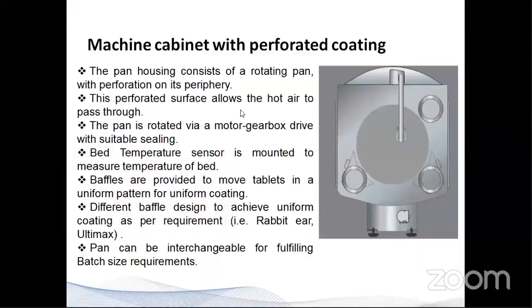I will talk about the Kevin machine cabinet with perforated coating. The pan house consists of a rotating pan with perforation on its periphery. This perforated surface allows the hot air to pass through. The pan is rotated via motor gearbox drive with suitable sealing. A bed temperature sensor is mounted to measure the temperature of the bed during the process. Baffles are provided to move the tablets in a uniform pattern for achieving uniform coating. We provide different designs of baffles, including rabbit ear type as well as Ultimax type. We also provide interchangeable pans for handling different batch sizes up to 48-inch pan size.